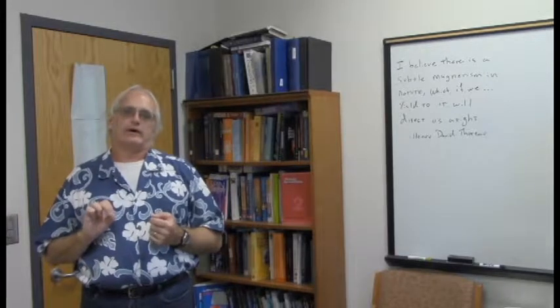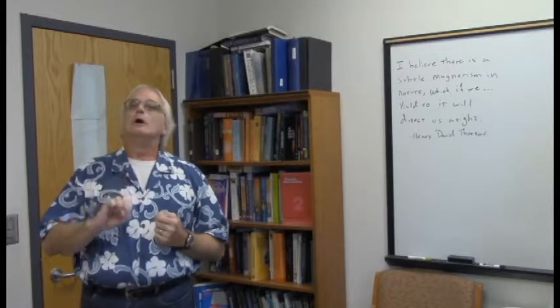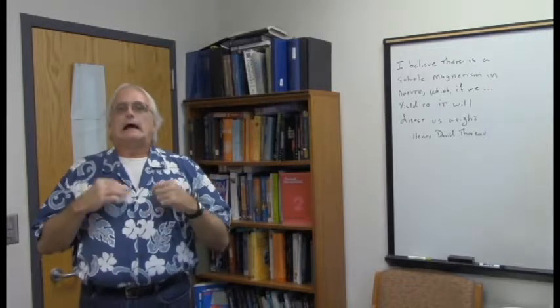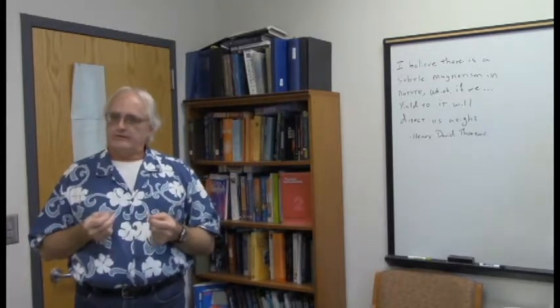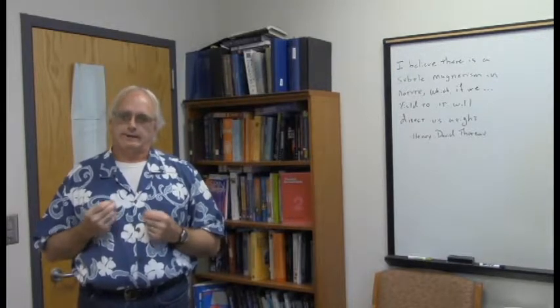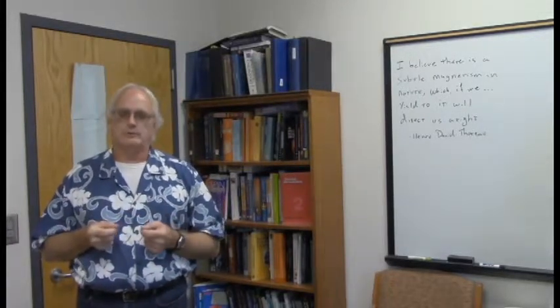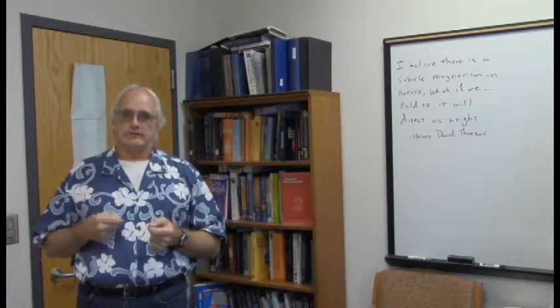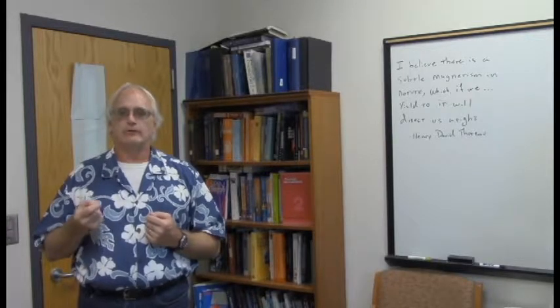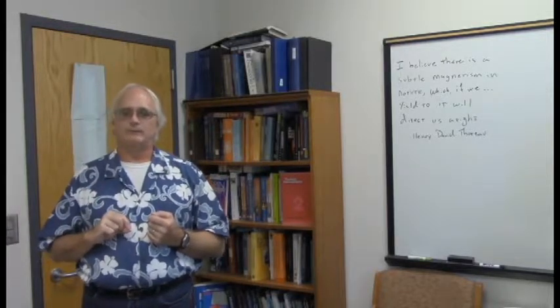And HSQC spectra, remember, tell us which proton is connected to which carbon. And so we have a proton axis and a carbon axis. I'll show you the way it works. It's actually simpler in some respects to use than the COSY spectrum. We don't have the diagonal in an HSQC like we do in a COSY. But the interpretation of it is very similar. For example, here is the group of equivalent methyls, the 2 methyl groups, 6 protons total, that integrates to 6. That doublet, the 2 methyls at the end of the isobutyl chain.